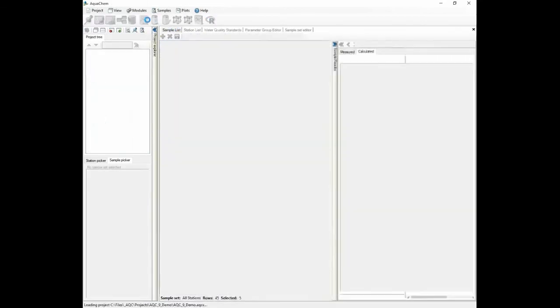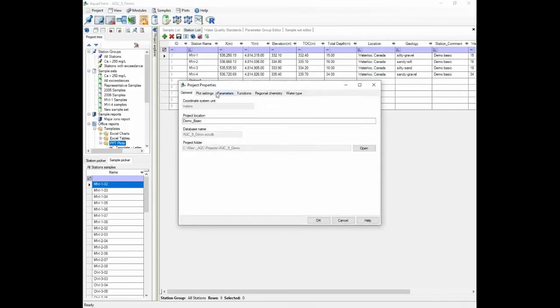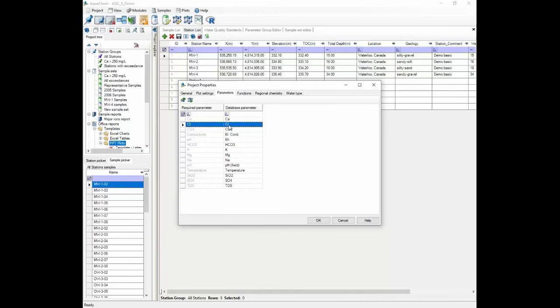So we're going to save that, and then what you do is, again, go into your properties and parameters. I can't remember if it renamed it. Yeah, so there it is. You go in there and you'd map it, and it would know that Clodo is that. Although in the background, Clodo was given the CL prefix, but that's how you'd remap things, or how you'd map them in the first place.